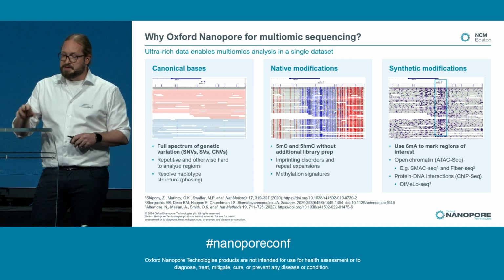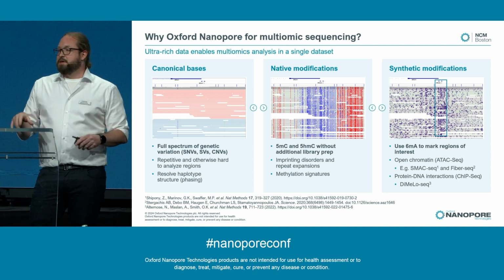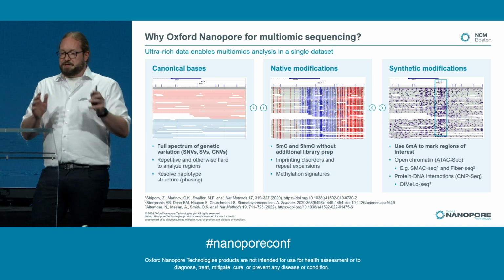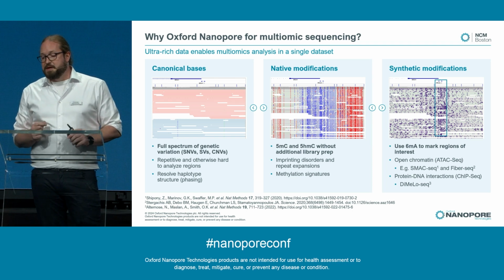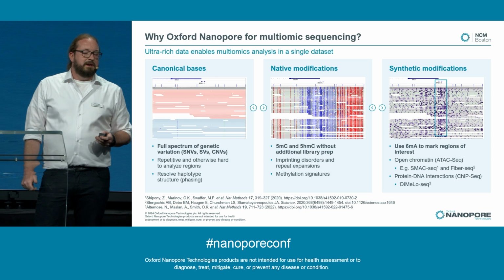One thing to point out here, and to come back to the initial question of that slide, is that this screenshot is from the same region in the same data set. And the only thing you need to do to get from one to the other is change your color by option in your genome browser. So this is the amount of information you get just from whole genome sequencing.